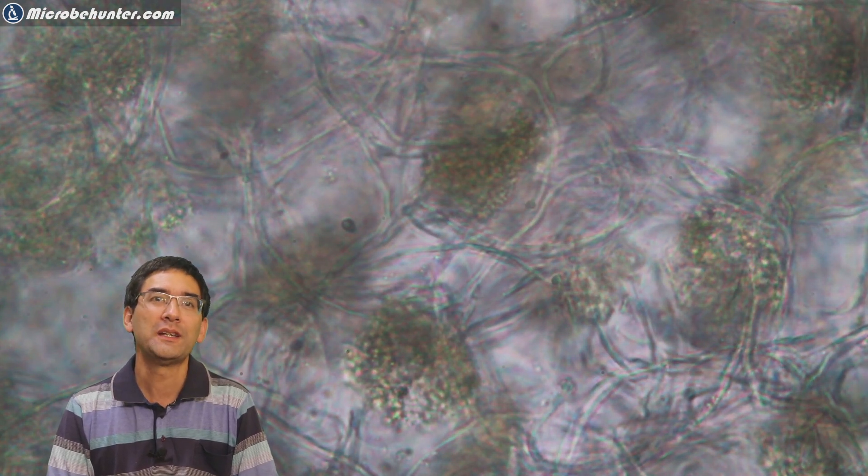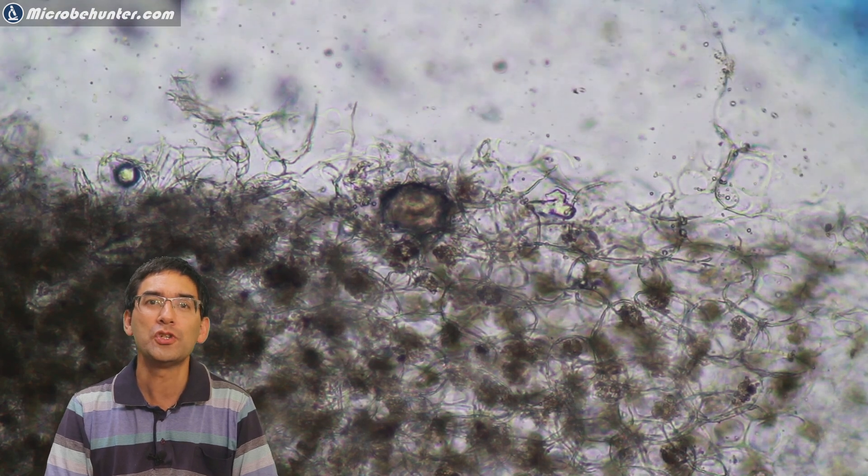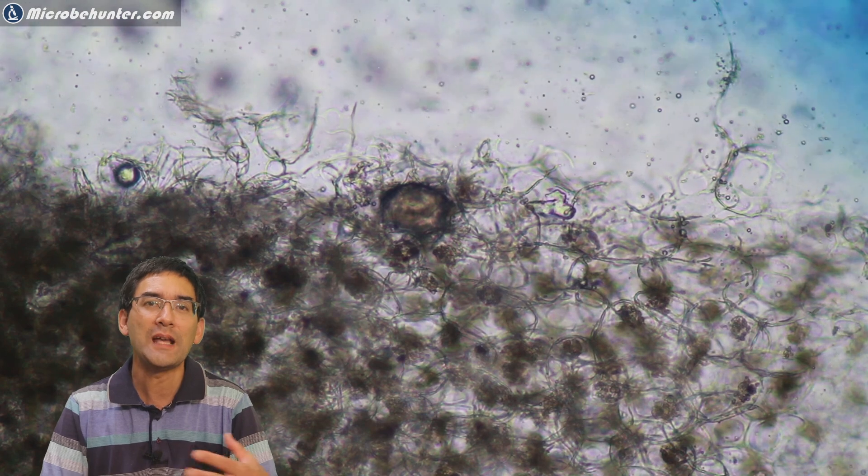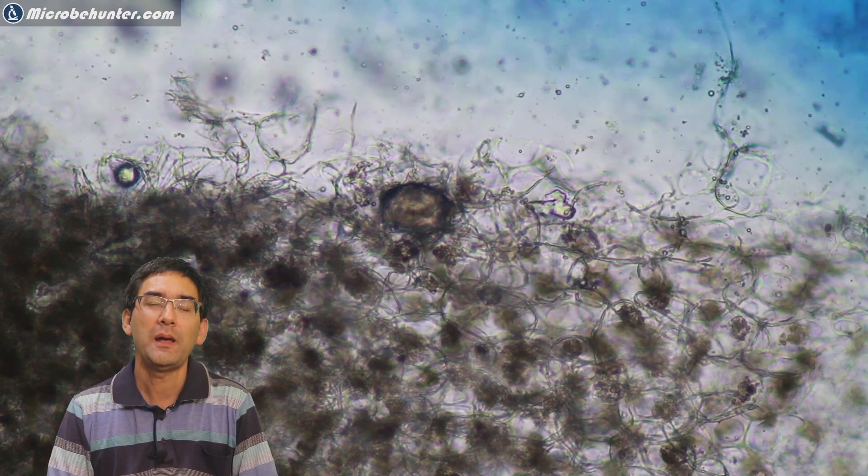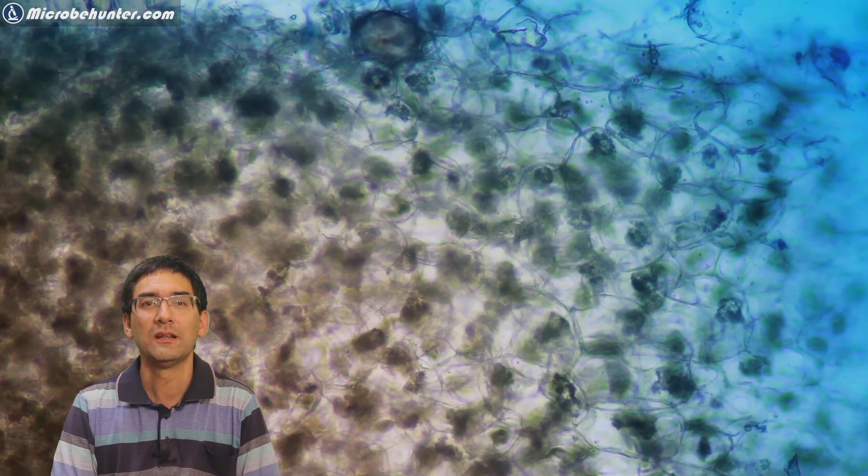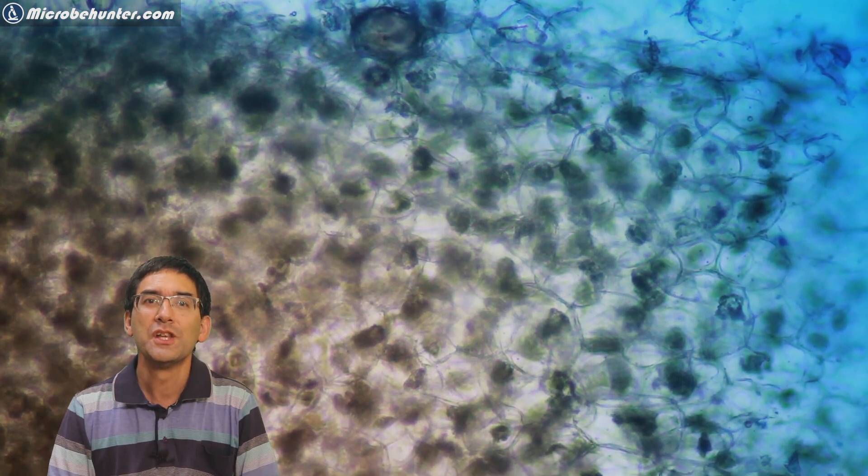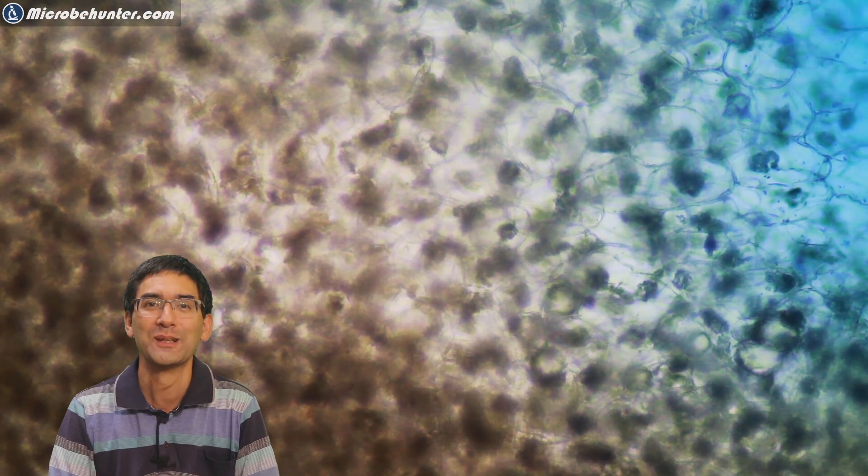What I've done next is I also added a little bit of methylene blue, which is a stain. I wanted to see how this stain reacts with the cells. Indeed, there is a little bit of a staining reaction and some parts inside the cell start to stain as well. This increases and improves the contrast a little bit.